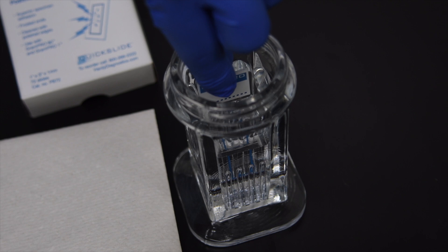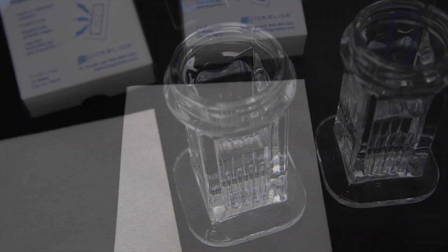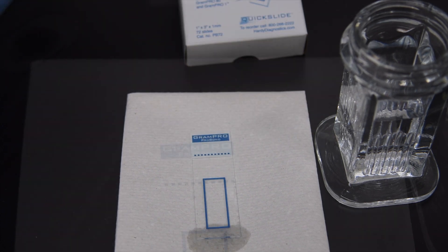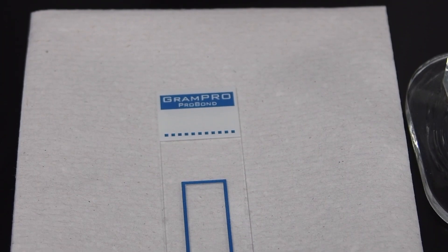Submerge the specimen into a Copeland jar full of methanol. Drain off the remaining methanol by tapping the bottom edge of the slide to a paper towel. Allow the slide to air dry completely.